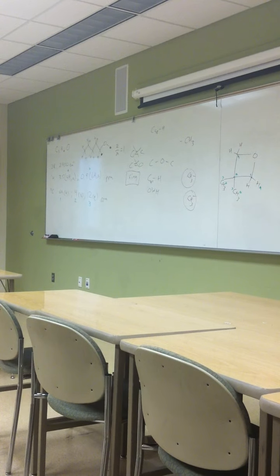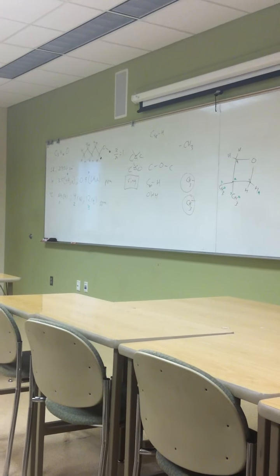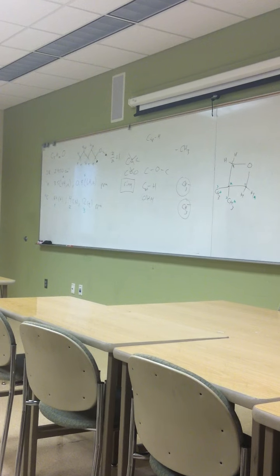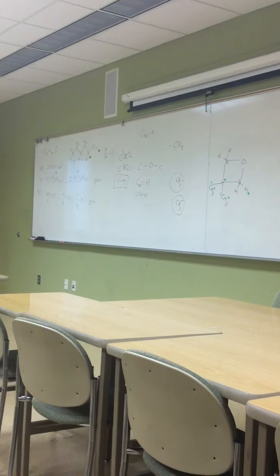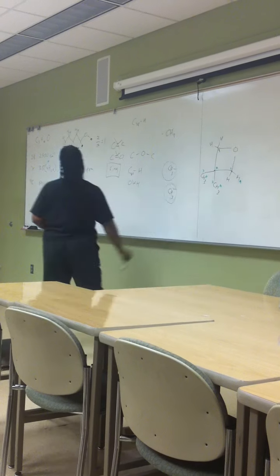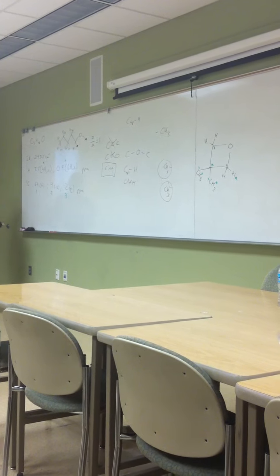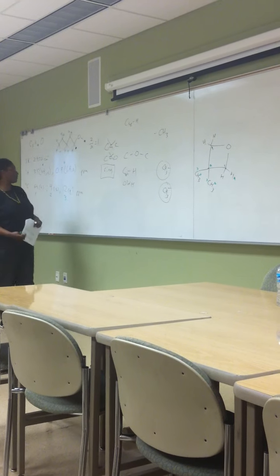The alkanes are from 0 to 30, and if the carbon is attached to an oxygen, you would expect 55 to 90 or so. So we assign these as being 1. Here, also, they're shifted further downfield. And then these were the 3s and the 2s.